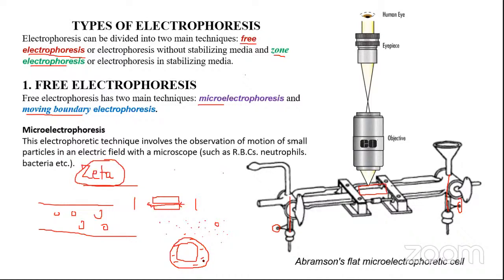So in short, some water molecules will be held tightly onto the surface of any charged entity, while as you move away from this surface, the water molecules will get loose and loosely associated with the surface, right? So in one way, what Janki was saying is correct. It is the potential difference between those molecules which are closely associated compared to those molecules which are in motion. This difference.